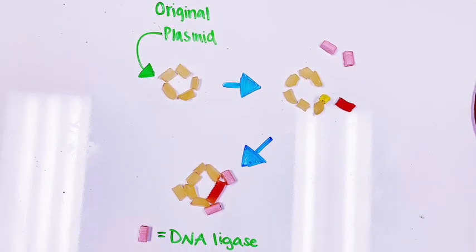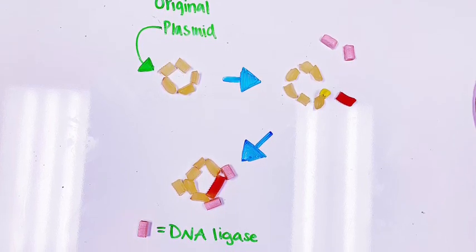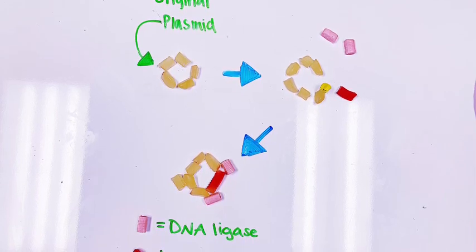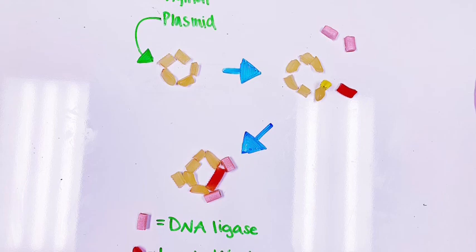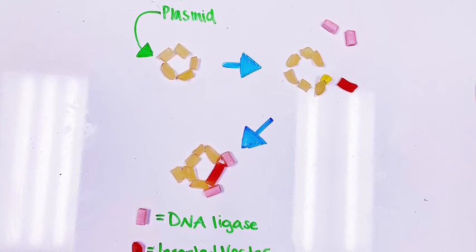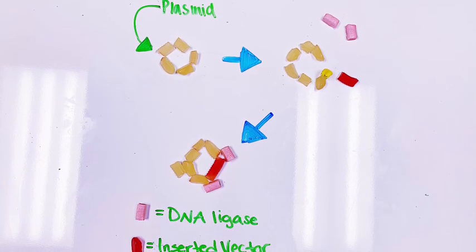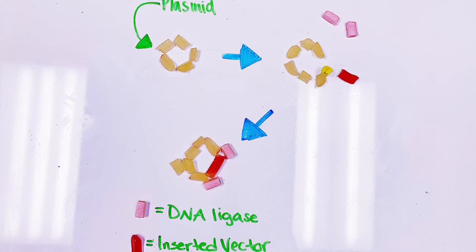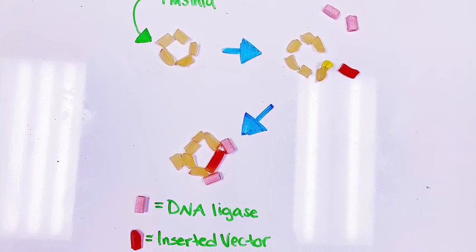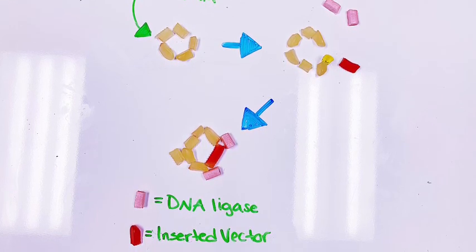DNA ligation. Ligation refers to the joining of two DNA fragments through the formation of a phosphodiester bond. An enzyme known as ligase catalyzes the ligation reaction. In the cell, ligases repair single and double-strand breaks that occur during DNA replication. Molecular cloning is a method to prepare a recombinant DNA molecule, an extrachromosomal circular DNA that can replicate within a microbial host.